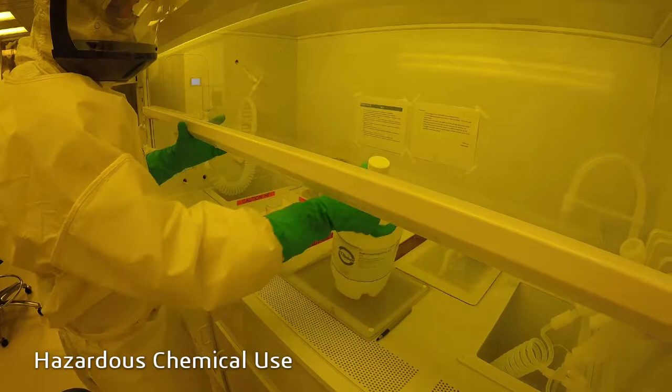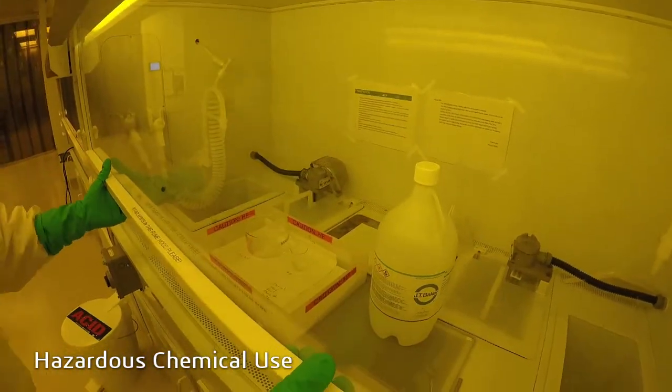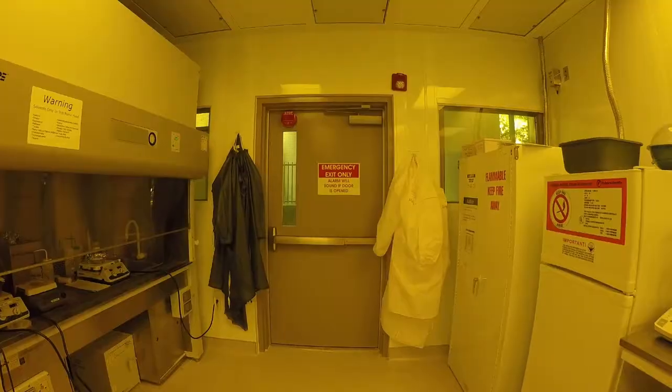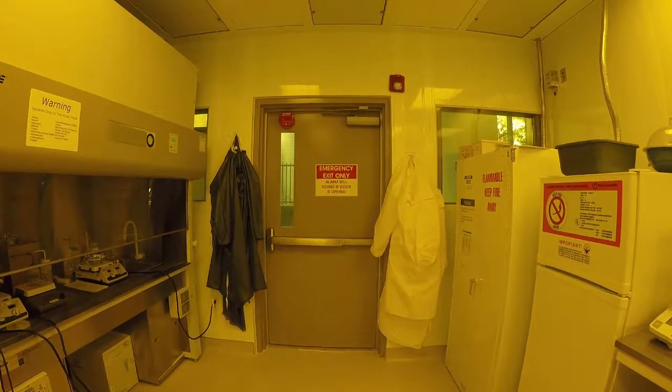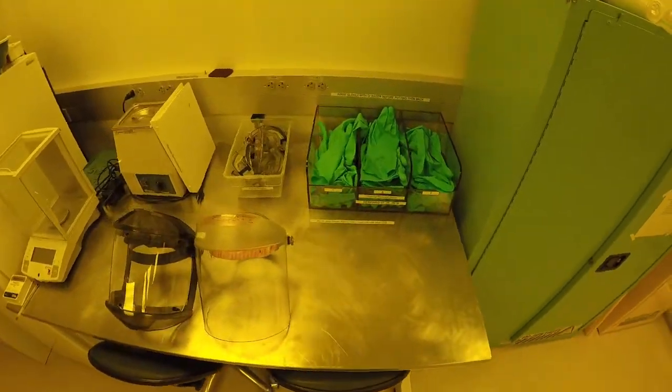When handling hazardous chemicals, additional controls are required for your safety, such as personal protective equipment and secondary containment. Full PPE consists of chemical resistant aprons, goggles, face shield, and heavy nitrile gloves.